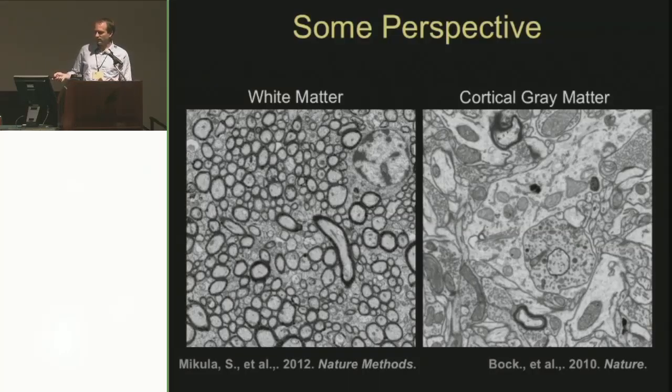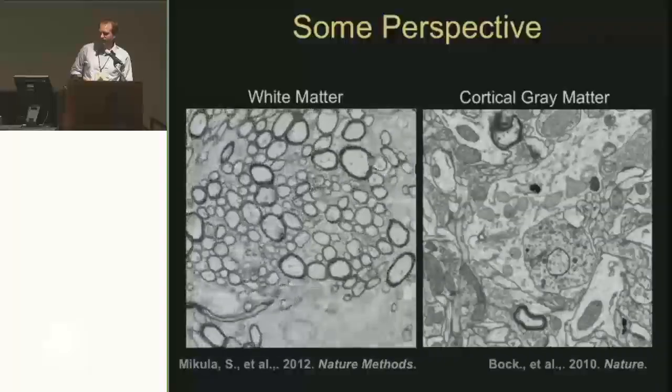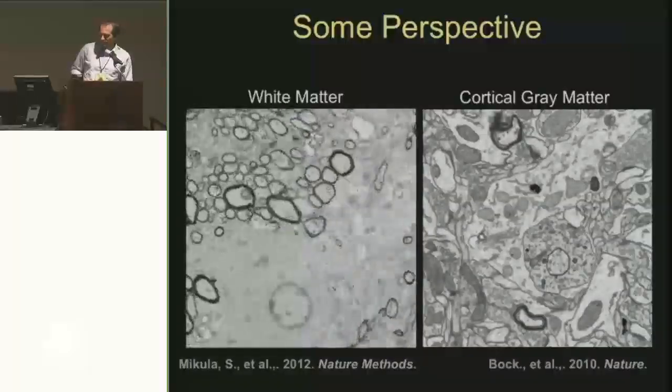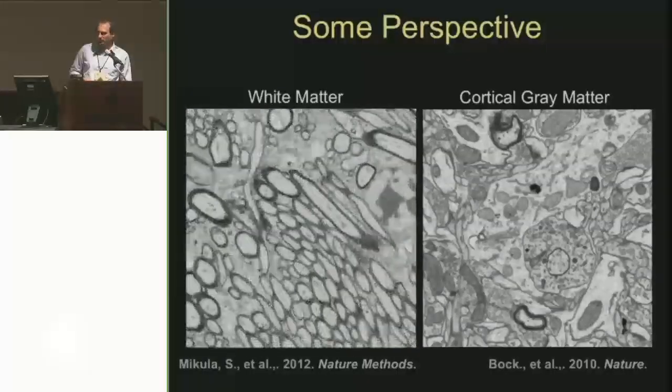These are our 3D electron microscopy data sets from animals, from fixed tissue. So if you look at the white matter here of an animal in the external capsule, you can really appreciate just the extraordinary amount of detail that's going on here. So you can see a glial cell at the bottom, and just a number of white matter tracks interspersed with one another going many different ways.